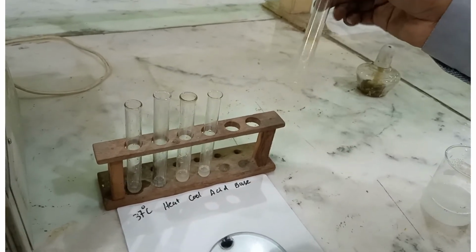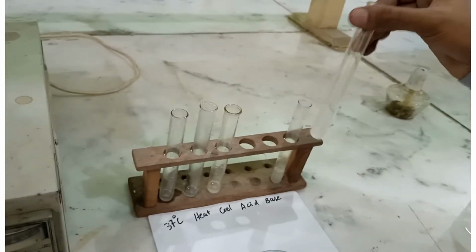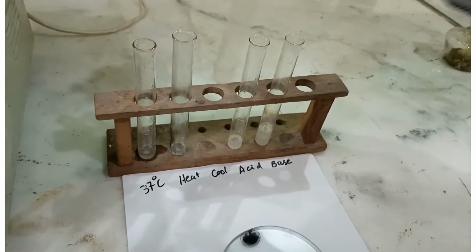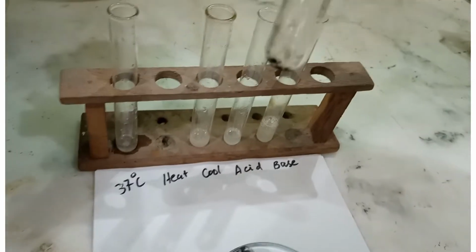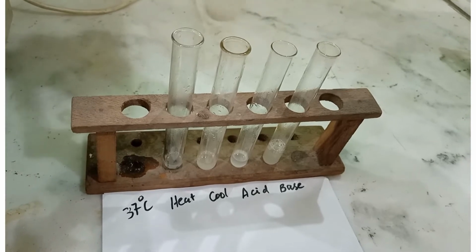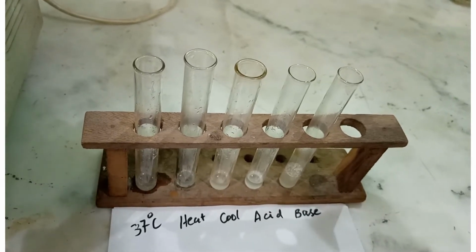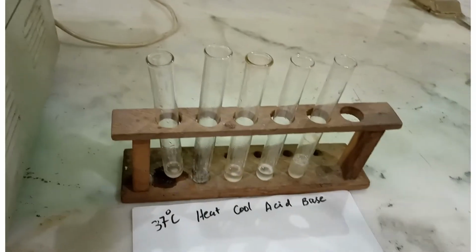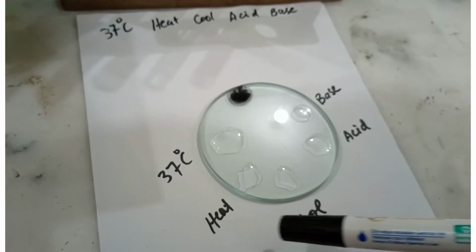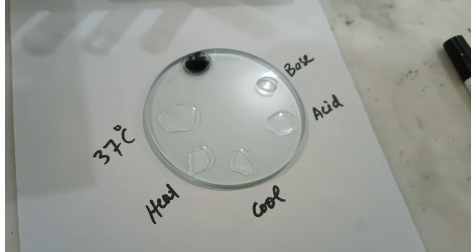We have to shake the tubes in order to mix saliva with the starch. Allow these test tubes to react saliva with starch for 5 minutes, and then we'll test with iodine. Now we have taken one drop from each tube onto the reaction plate. Here it is for base, for acid, for cool, for heat, and for 37 degrees centigrade. Now we are going to put one drop of iodine solution in all the drops from the test tubes.